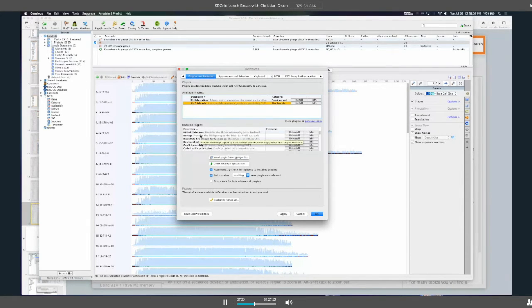I'm kind of shining a little bit of light on this right now because when I talk about workflows later, you're not going to be able to use portions of the workflow if you don't have the corresponding plugin installed. For instance, you won't be able to use the BBMap mapper in your workflow builder if you don't have the plugin installed. Same thing for coil prediction and everything else. So make sure to check this out and install them.